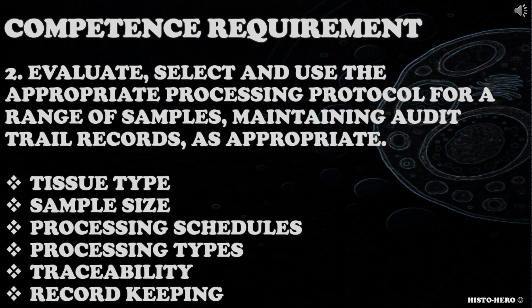When addressing this competence requirement, candidate could consider various tissue types processed in your lab, sample size, processing schedules available, processing type like automated, manual or rapid, traceability, record keeping and so on.